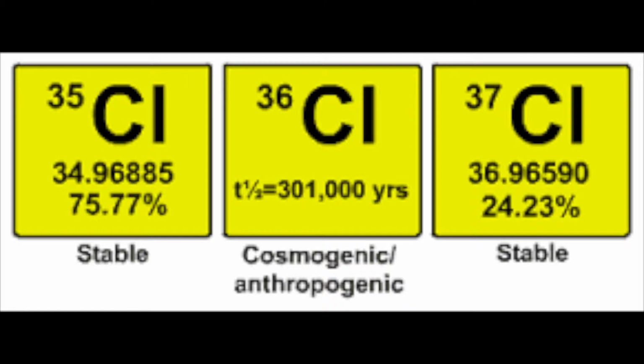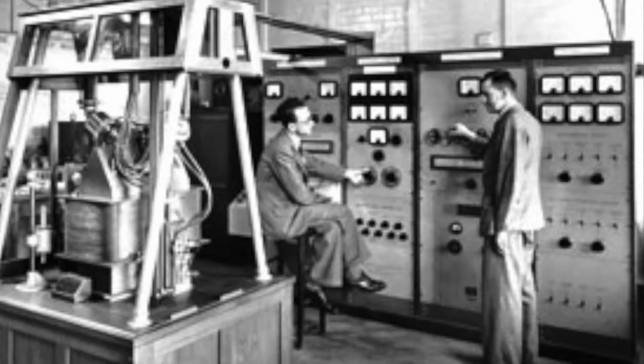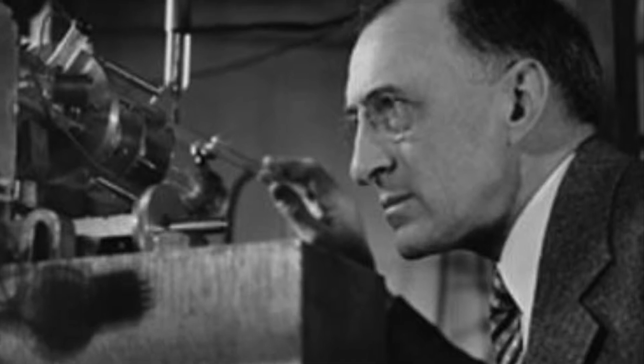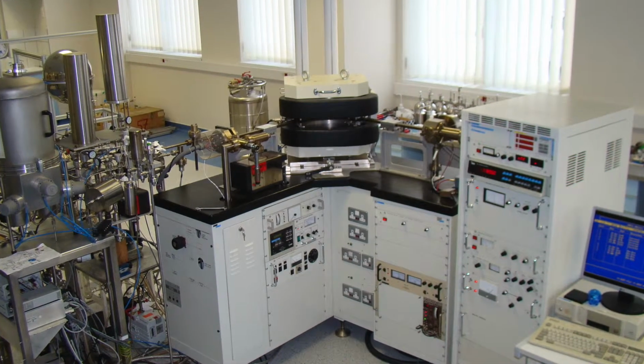Most scientists began to use the mass spectrometer as the 20th century continued, as it was able to find finite amounts of particles and isotopes. Modern techniques of mass spectrometry were devised by Arthur Jeffrey Dempster and F. W. Aston in 1918 and 1919 respectively. Mass spectrometers are now very common throughout the world.